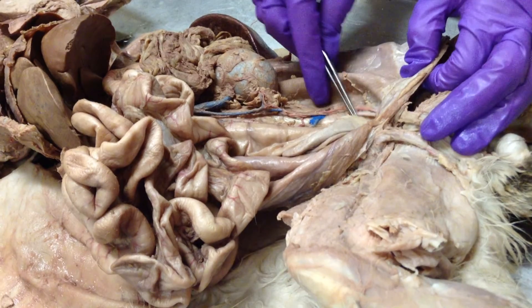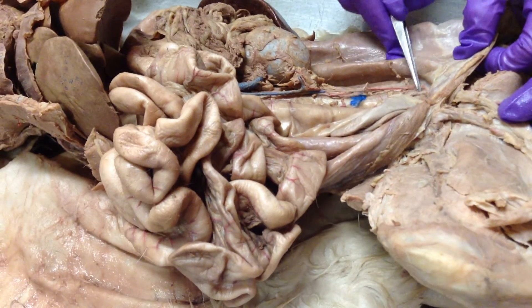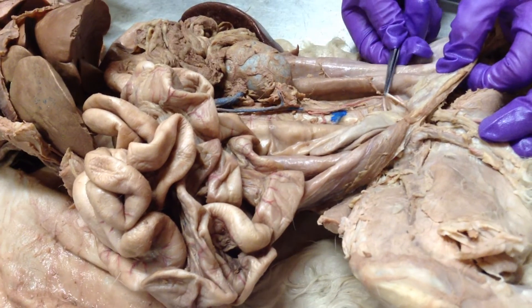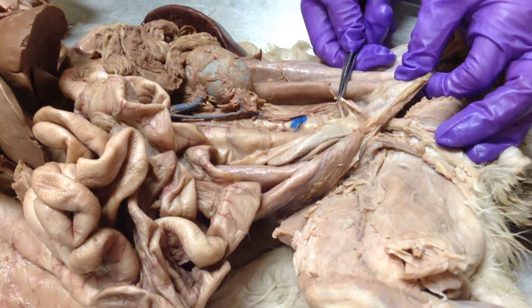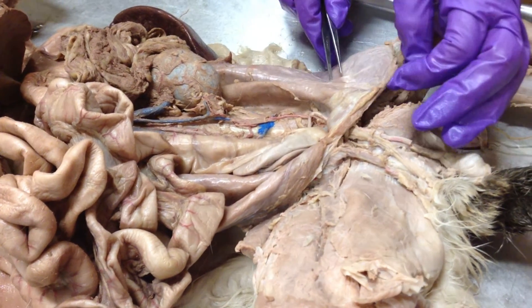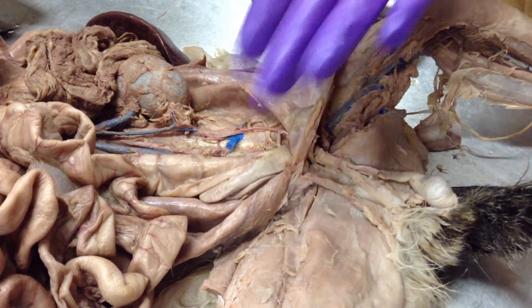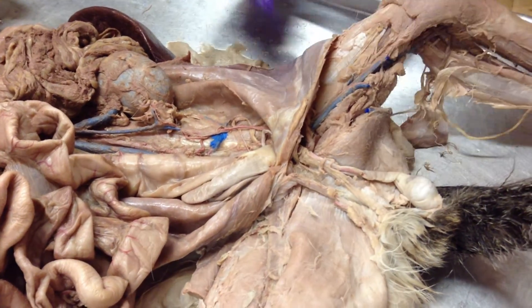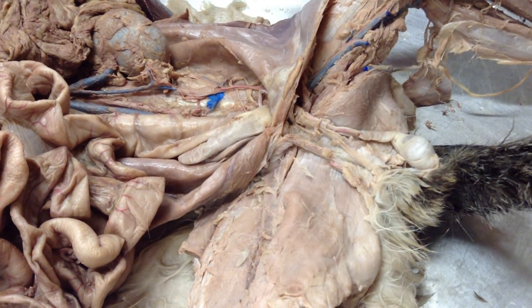There's the vas deferens — you can see it, it's really white, running next to the artery through the wall. I can't show you more on this cat because we need to keep the wall intact. I can show you on another male cat.